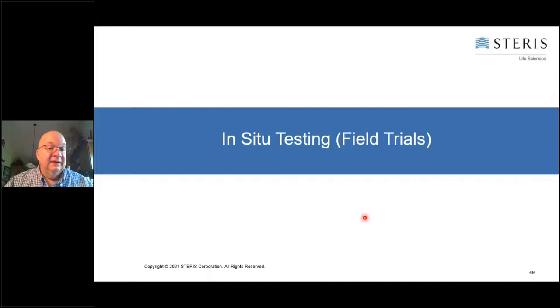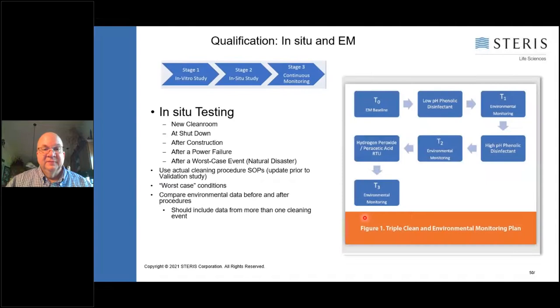So let's take a snapshot of this. I published a couple of recent articles out there in American Pharmaceutical Review on this topic. Some of the key things that you need to keep in mind are, it's best to do this type of testing when you're putting in a new clean room, after a shutdown procedure, construction event, power failure, or any type of worst case event.